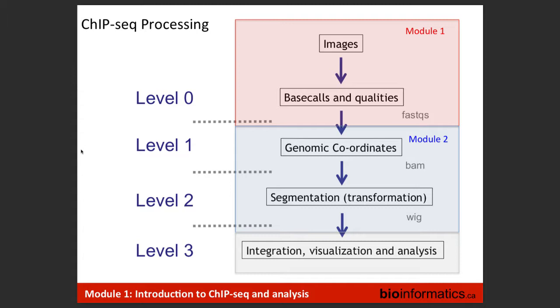How stable is it? Do you need to retest them, or do they stay good forever? When we bring them in, we aliquot them and snap freeze them or store them at 4 degrees, so we essentially have working stocks. It's stable for at least a year. We will redo the validation, at least from the ChIP-seq, once a year if we have a sufficient stock, but it's a good point. You will see some degradation in the sensitivity over time. Specificity is fairly stable, as one might expect.